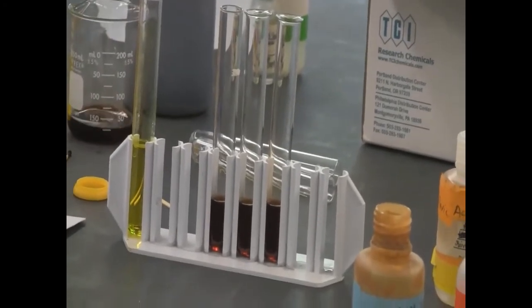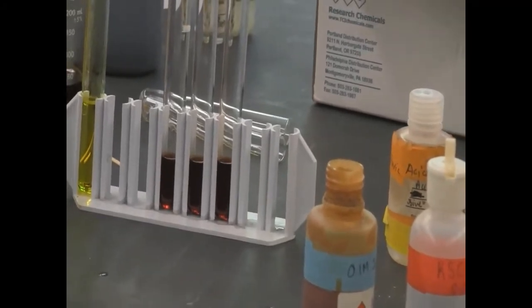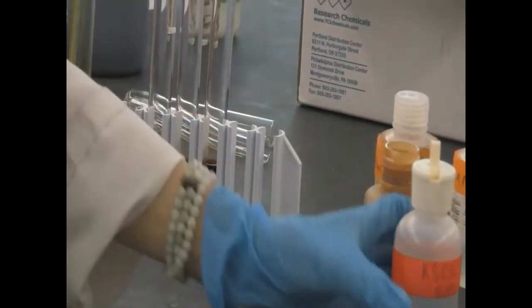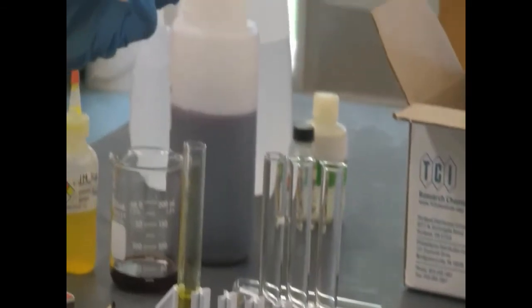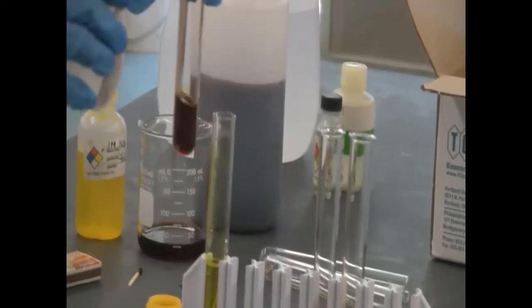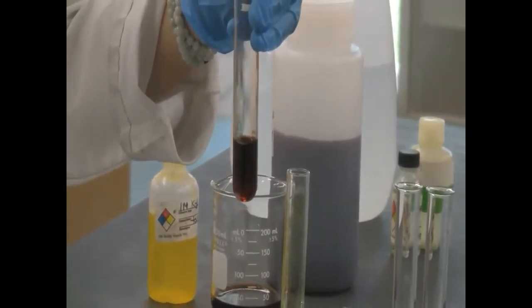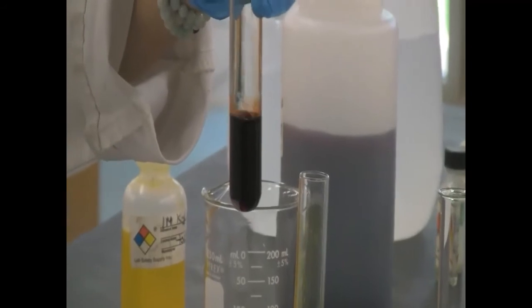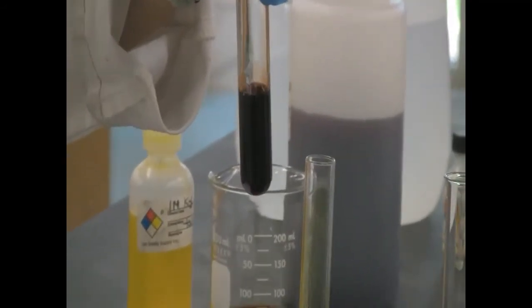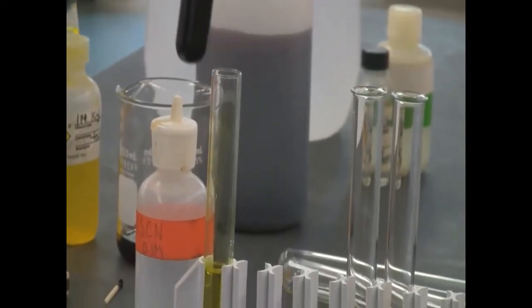Okay. So in our number 1 test tube, we need to add 20 drops of the potassium thiocyanate. Okay, add several drops, 20 drops.